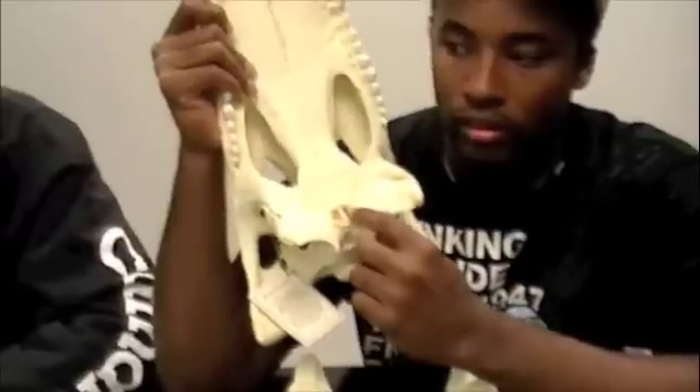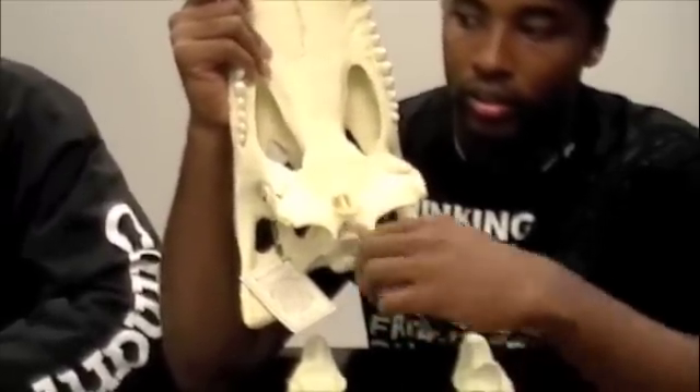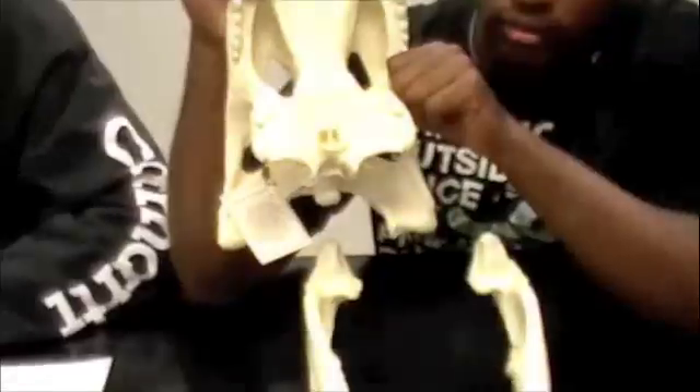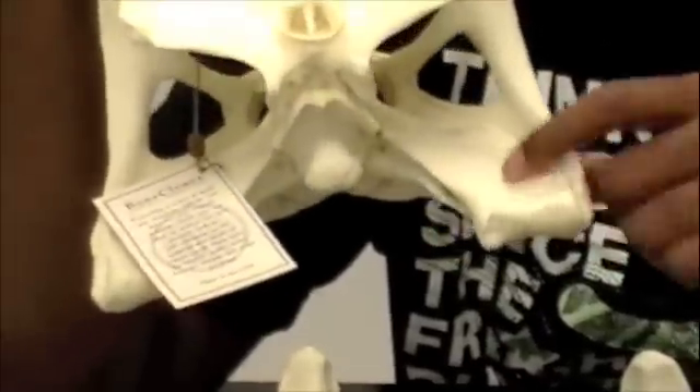Okay, put it up. Internal nostril. What is this? This is the palatine. Palatine. What's 13? Oh, it's back here — it's the quadrate.